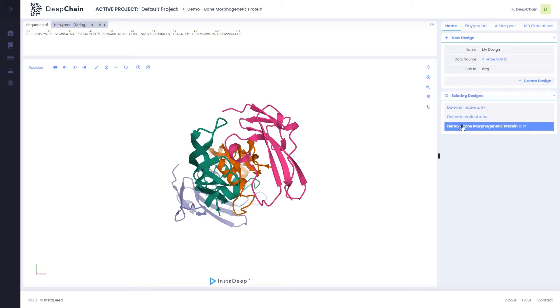As the simulations for the molecular dynamics can take several hours, we are going to load a design for which the simulations have already been computed. For the sake of the demo, here we are going to select a bone morphogenesis protein complex.